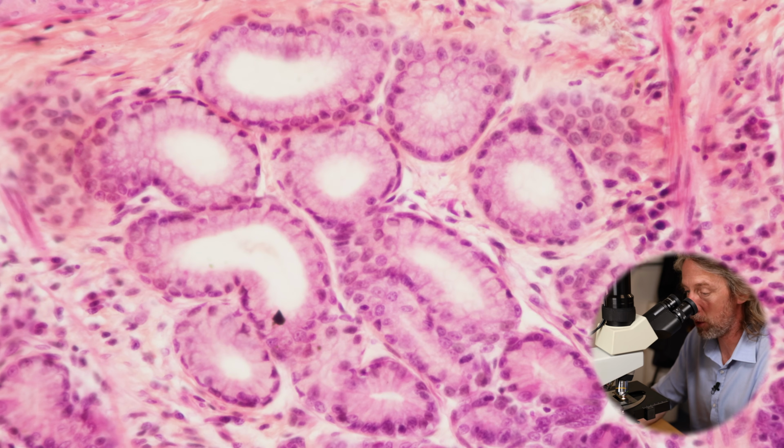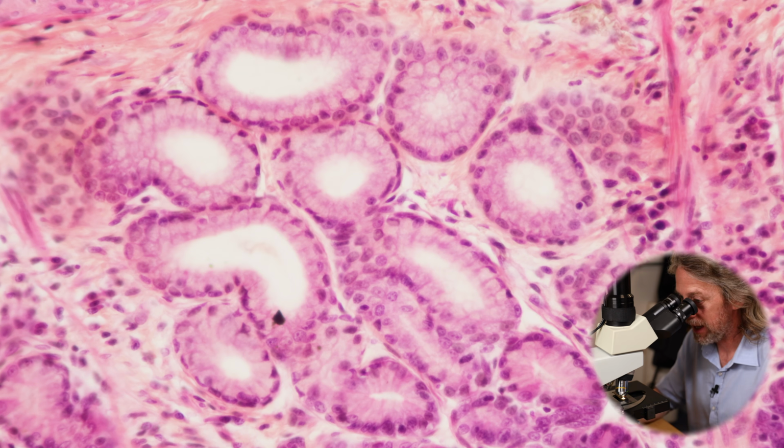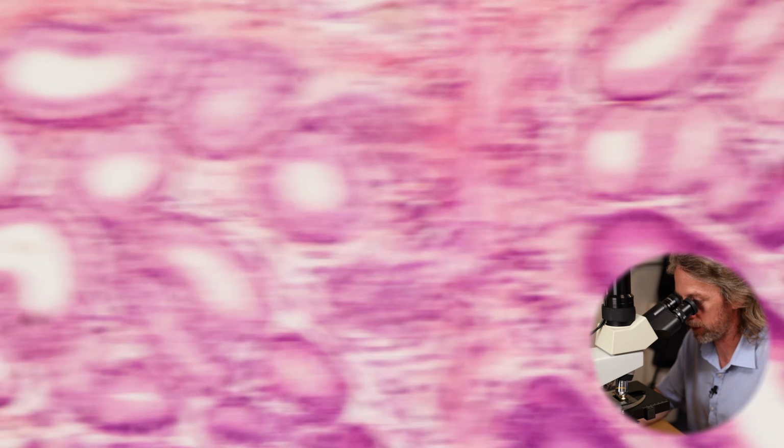But that's what I wanted to point out, mostly because remember this histology series is a look-see thing. So when people talk about the stomach and they say that the stomach has these cells and it's arranged like this in this area, but in other areas of the stomach it's a little bit different, here's an example. It looks a little bit different. No radical changes, it's just not quite the same as what we saw in the body of the stomach. That's all I wanted to point out.